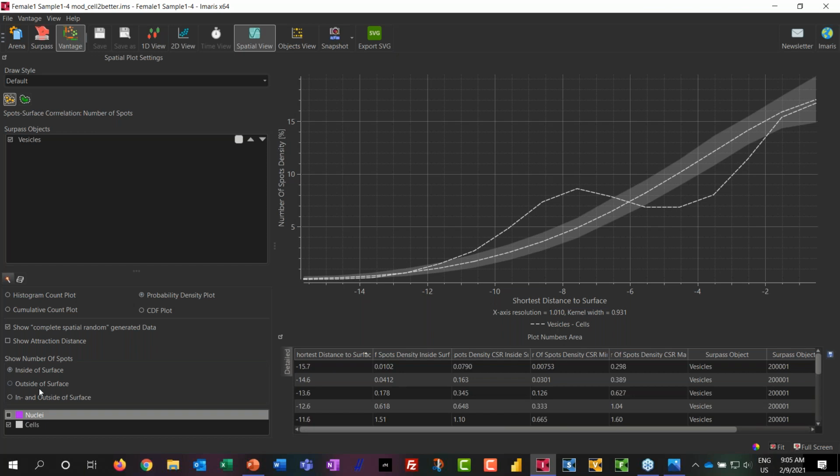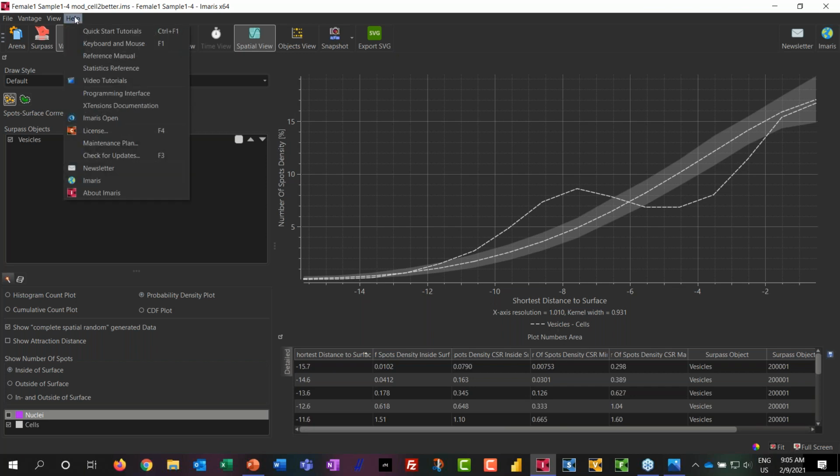Okay, and maybe to wrap up, an important one, as you're often using the sentence that Imaris automatically calculates some numbers, which might raise a question. So, what about publications? What about papers? Are all these measurements documented? Can users learn how the analysis is done to make sure they can publish it in methods?